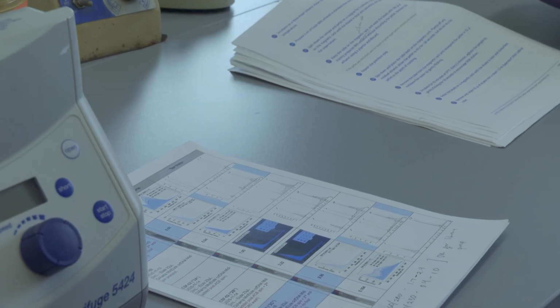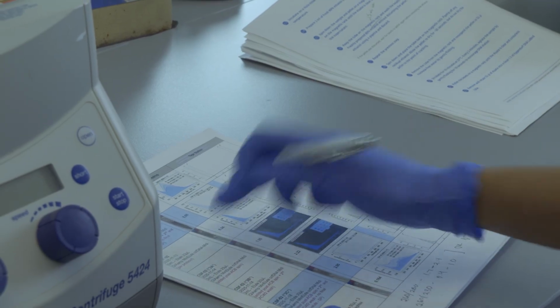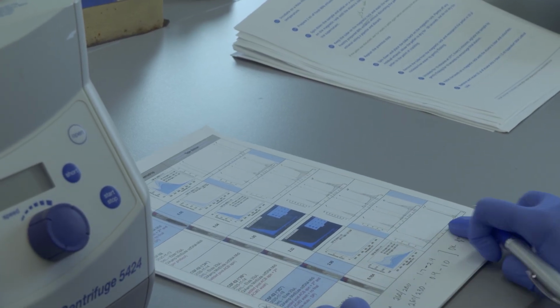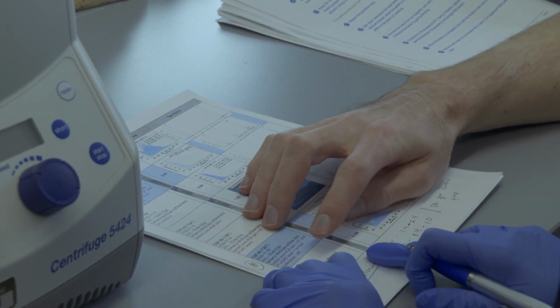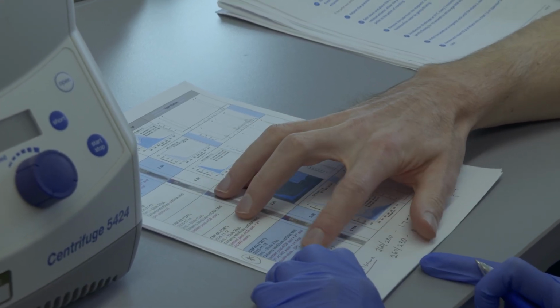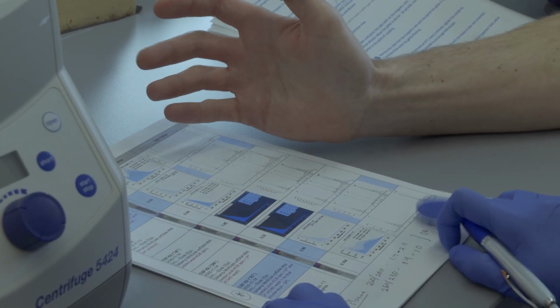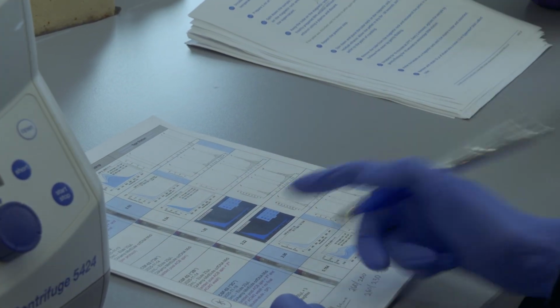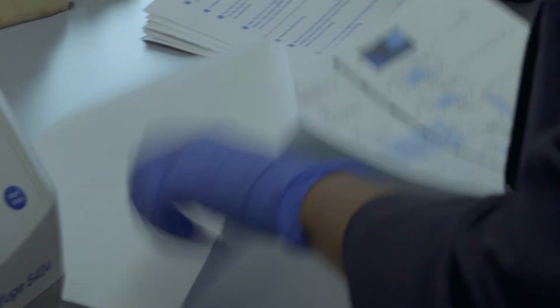Yeah, that's the issue, but let's try it. Number two, I don't think there is anything here. Yeah, right? What are these? This is also the same sample. We tried to run them all on a different extraction protocol, which didn't work. This one does not work. Yeah, doesn't work.